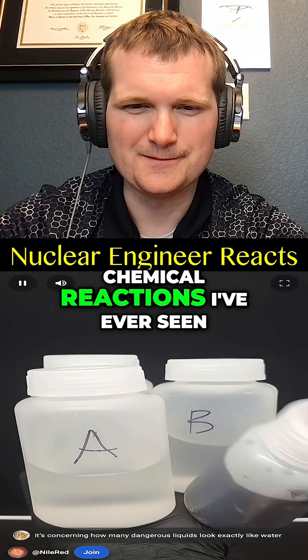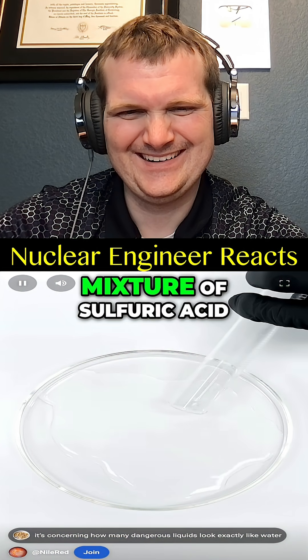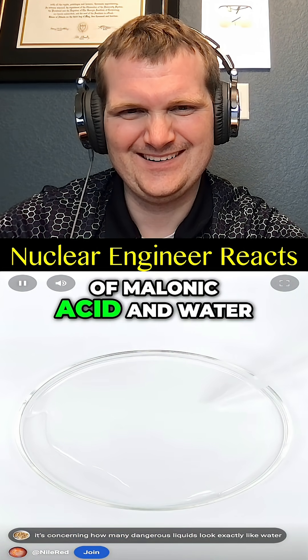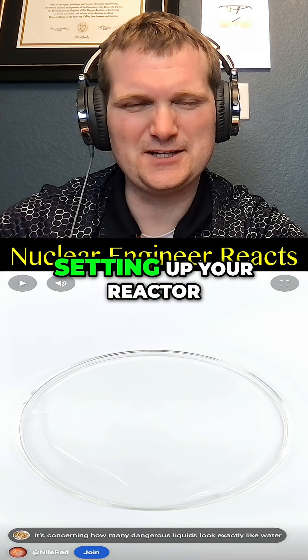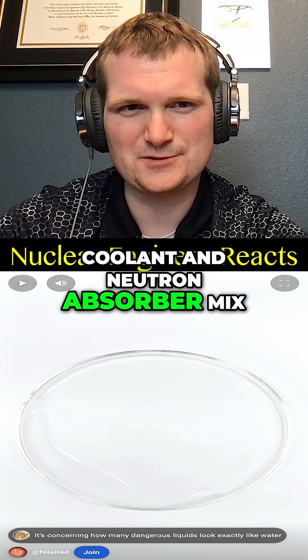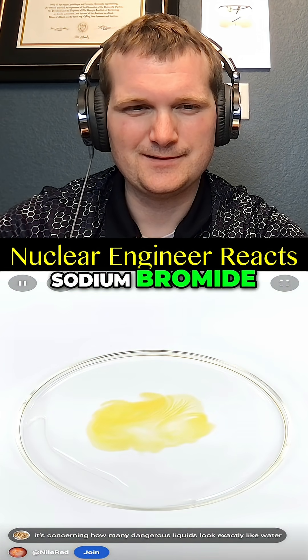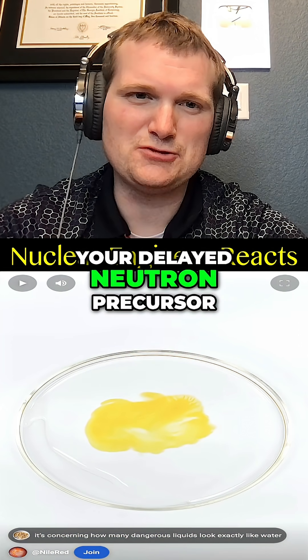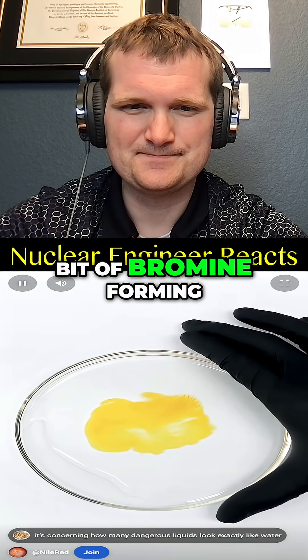I'm going to be doing one of the weirdest chemical reactions I've ever seen. I'll start with a dish and add a mixture of sulfuric acid and sodium bromate, followed by a solution of malonic acid and water. In nuclear terms, this is a bit like setting up your reactor coolant and neutron absorber. Then I'll shoot in a solution of water and sodium bromide, and it almost immediately turns yellow — this is as if your delayed neutron precursor suddenly kicked in and you're getting a reaction. This is just a bit of bromine forming.